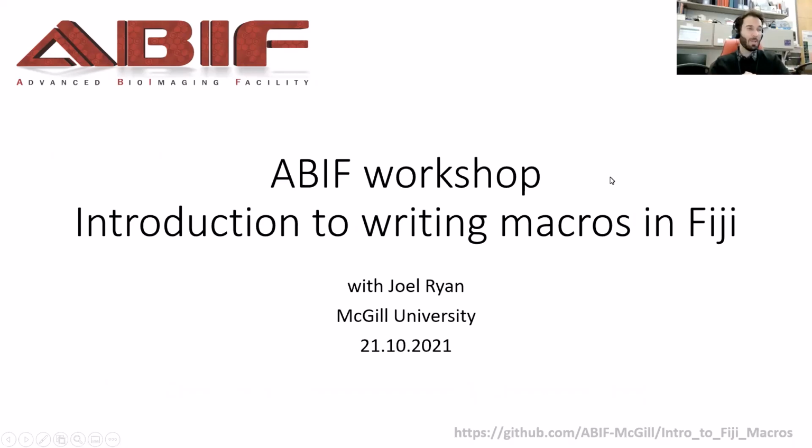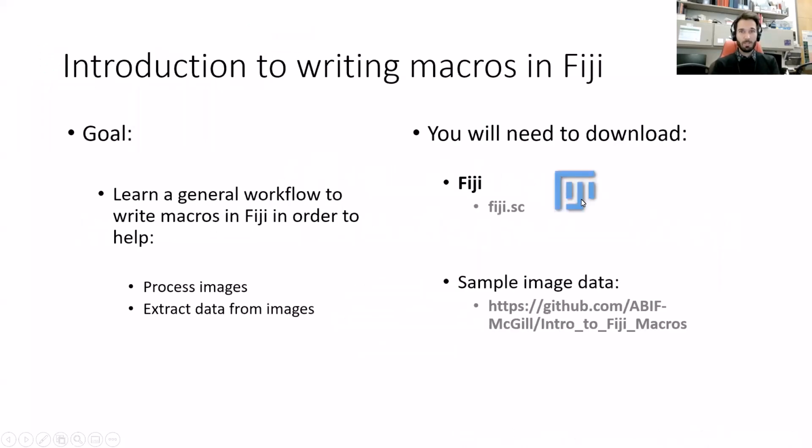Welcome to the ABIF workshop, the Introduction to Writing Macros in Fiji. I'll just go through a few introductory slides, what we're trying to do today, and we'll get going directly in Fiji. So the goal of today is essentially to teach and learn a general workflow for writing macros in Fiji, with the general goal of trying to help process images and extract data from images.